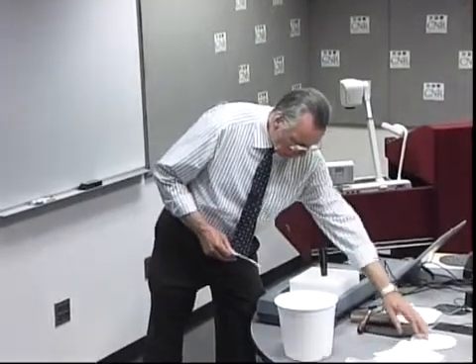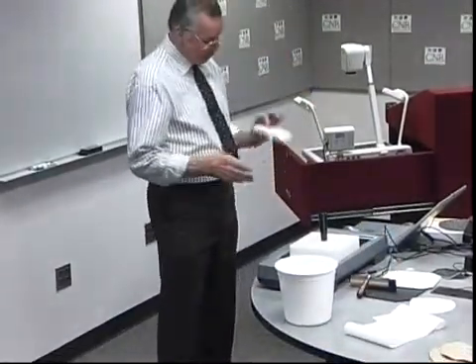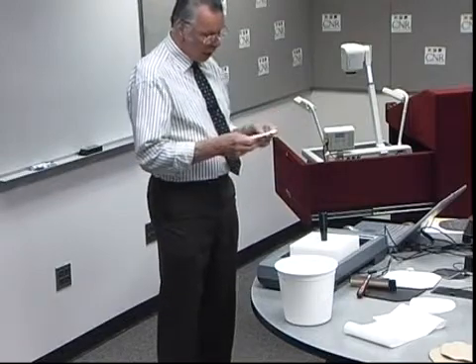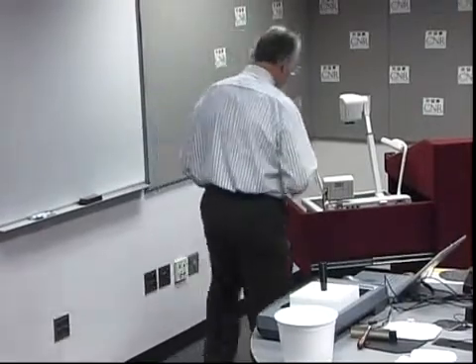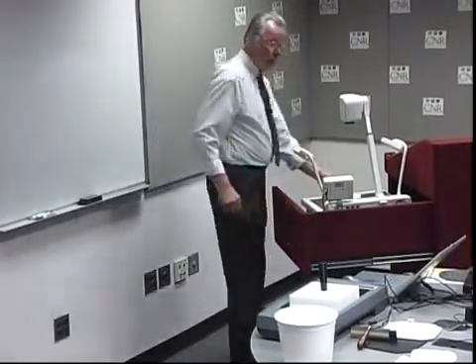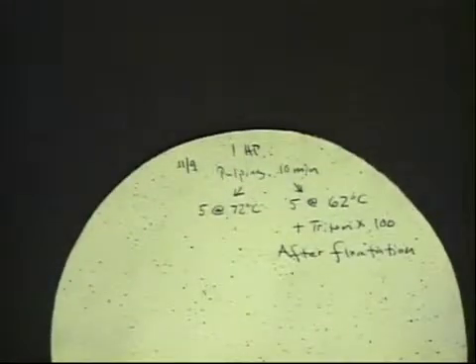We'll take this same hand sheet that is wrinkled, and I want to show you how we would do it in a process operation. Now here in the studio we are limited. This hand sheet has been dried and we've handled it many times, and perhaps I should go over here again to the table, and you can see there is writing on the back of the hand sheet.